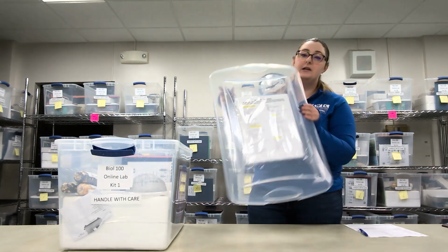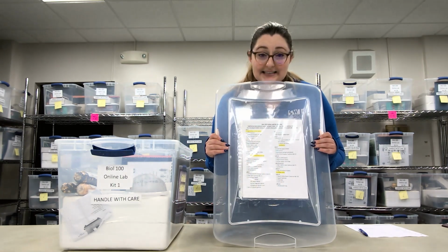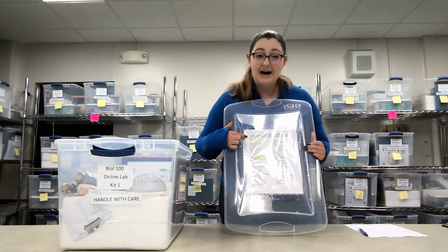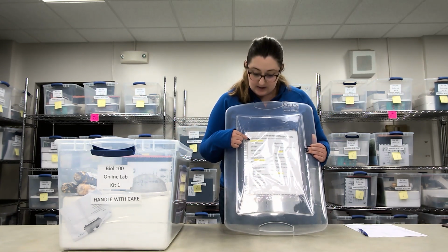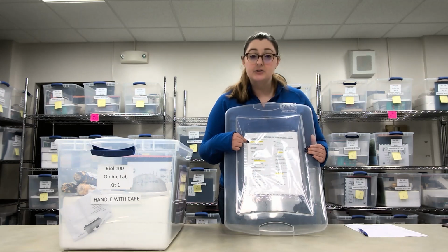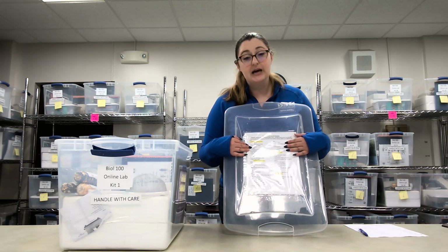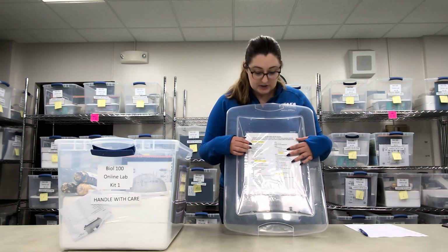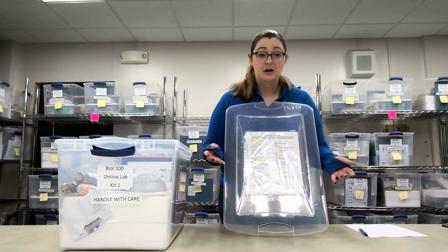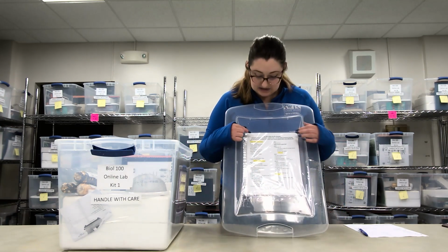If you flip the lid over to the other side, you're going to see that there is a list that goes through by lab what you need to complete the lab. The other thing you're going to notice is that there is a handful of items that are highlighted. You are not going to put those items back into the kit when you are finished with those labs. So if you do, it's probably messy. Please don't put it back in. I would prefer for you not to do that.